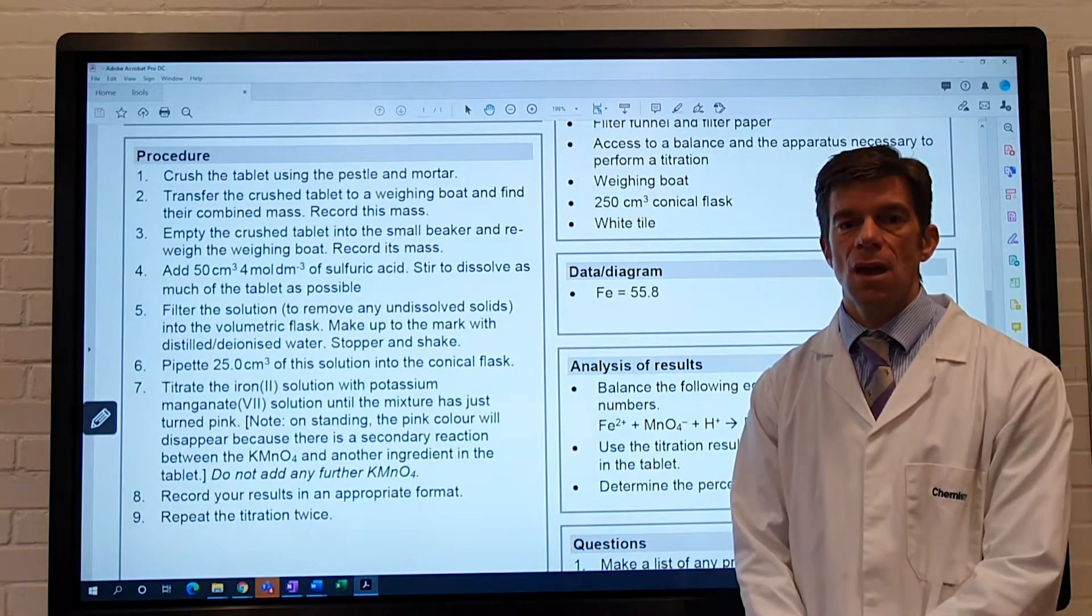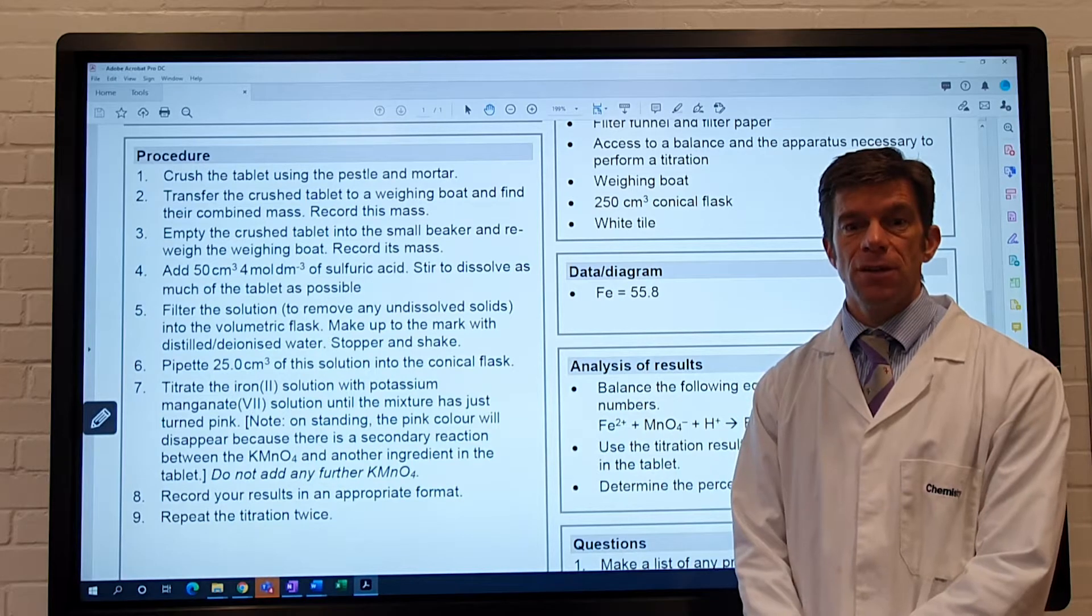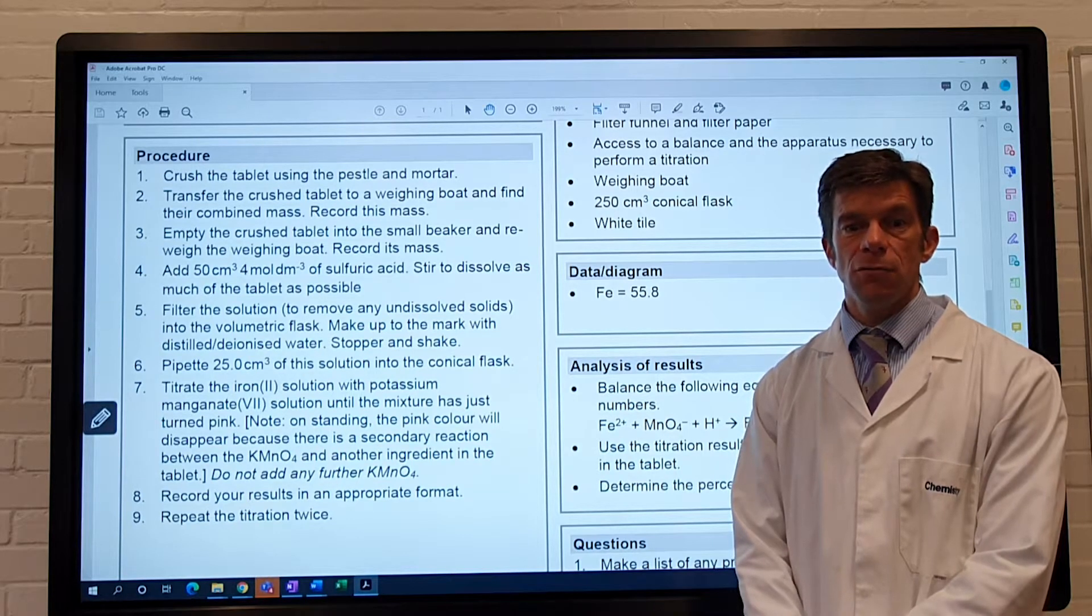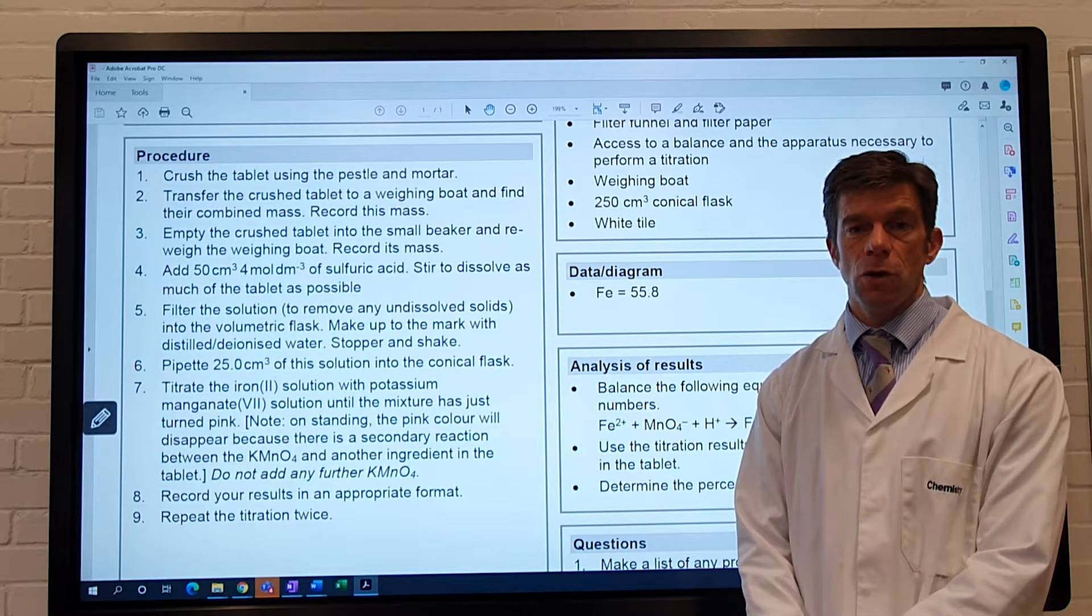Step 3, empty the crushed tablet into the small beaker and re-weigh the weighing boat, record its mass.